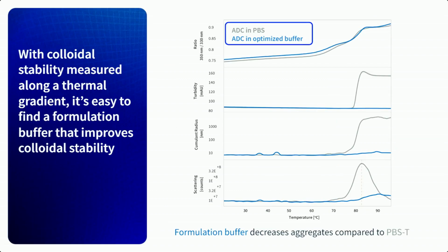So here we're looking at the same ADC we were previously looking at, Kadcyla. Now we're comparing it in PBS, a buffer commonly used during the triage process, to an optimized buffer ultimately used to store and ship the ADC.